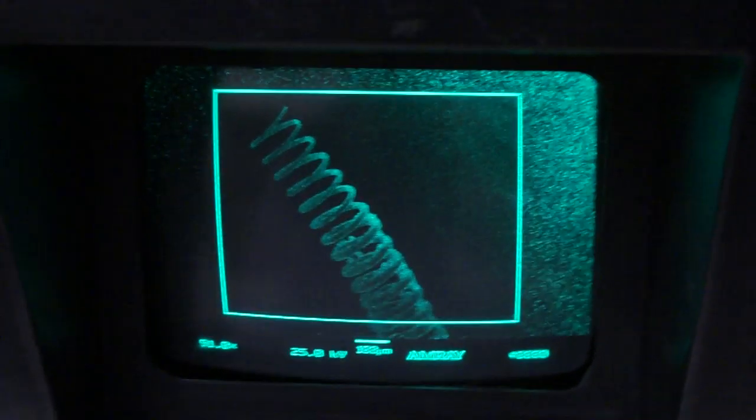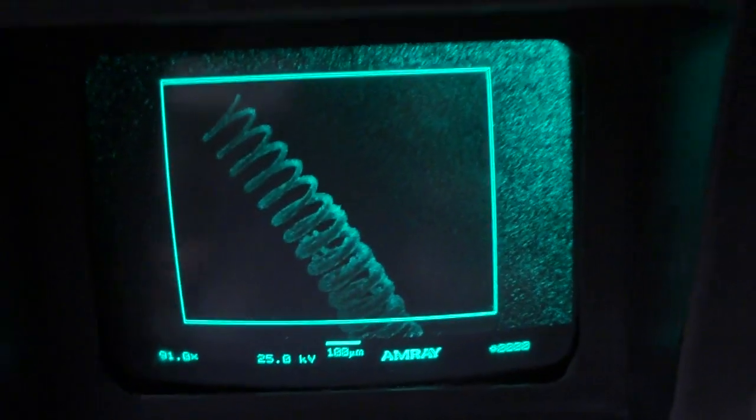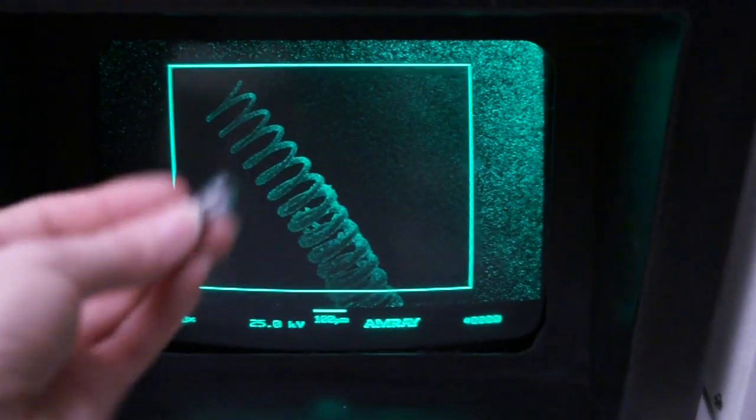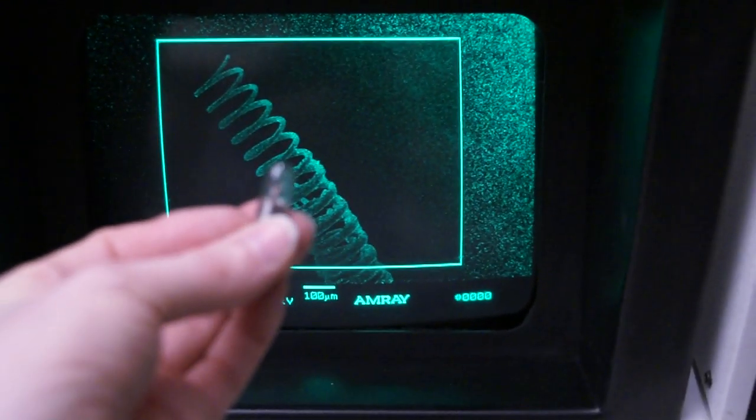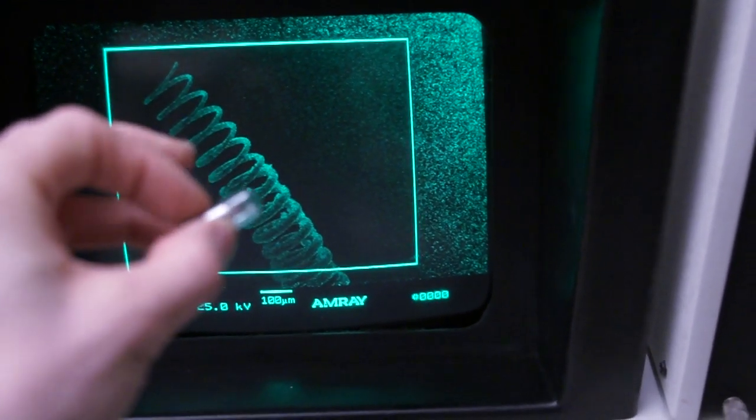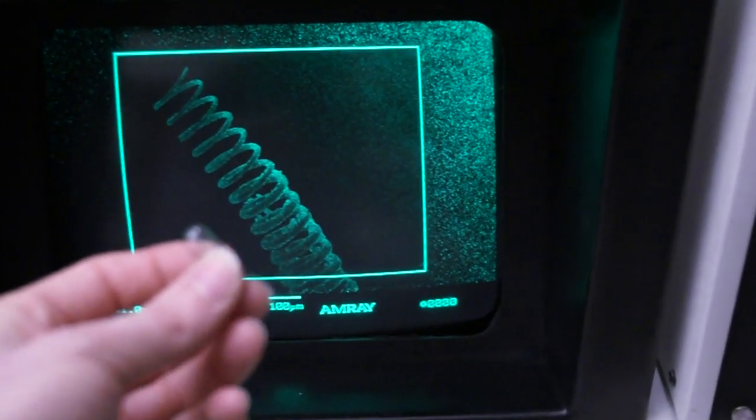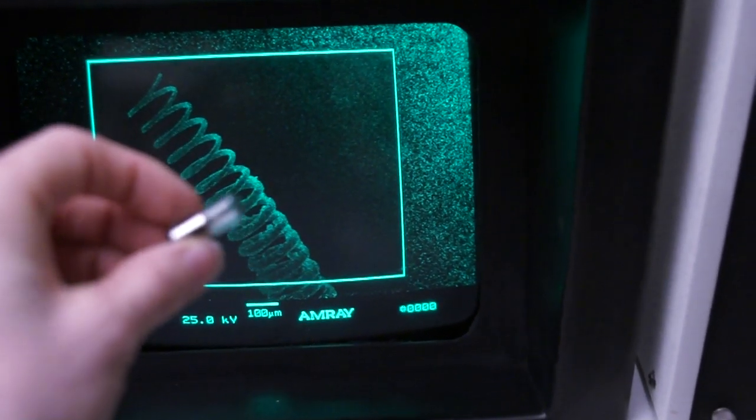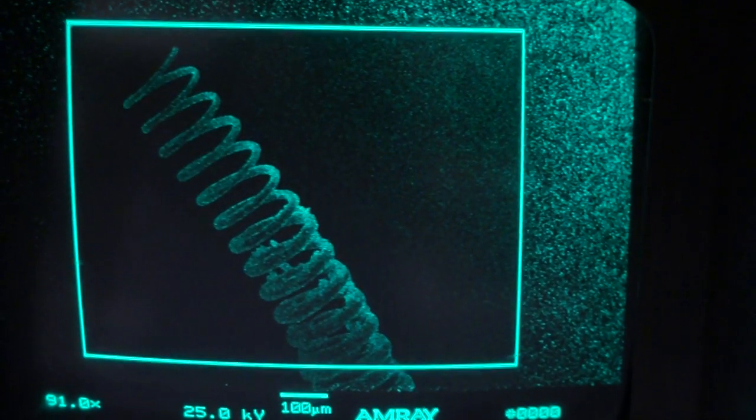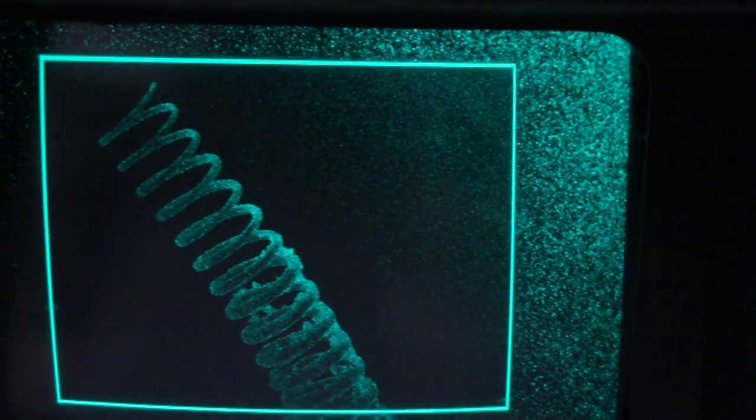And so this is what I'm going to show today. I'm still learning how to adjust the microscope, but I'm getting some pretty good images out of it now. So this is the filament out of a burned-out light bulb. I cracked open a light bulb, put it across a 9-volt battery until the filament burned out, and then I stuck it in the microscope so we can take a look at it. So you can see here it's the little corkscrew-looking type filament. It's very small. This is almost 100 times the normal size. And I'll zoom in.